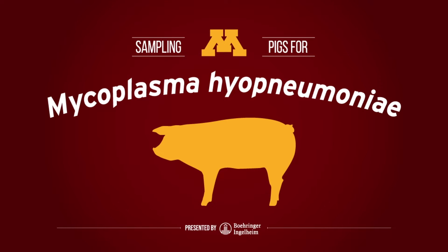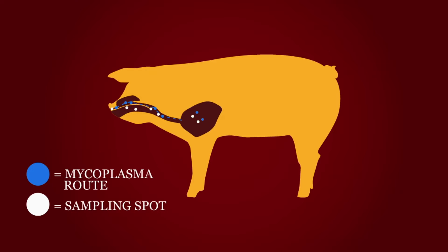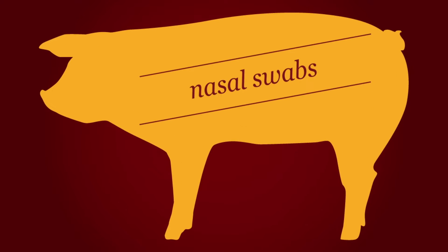There are several ways to test for Mycoplasma hyopneumoniae, and knowing which method is right for the job is key. In this video, we'll be testing for Mycoplasma hyopneumoniae using one of the quickest and easiest methods: nasal swabs.